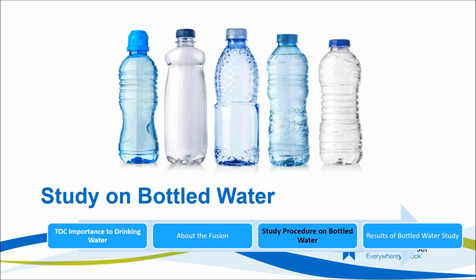All right, now that we established why we chose the UV persulfate and NDIR analyzer, the Fusion, for this application, let's set it up to run our bottled water samples. Please note that these images are not of the actual samples. This is just a generic picture.